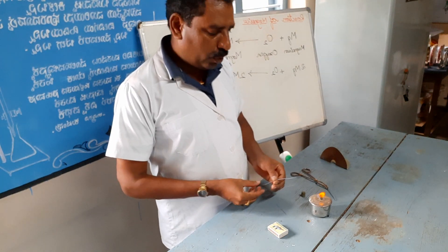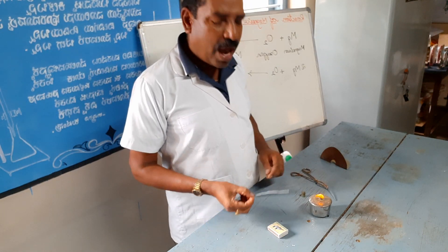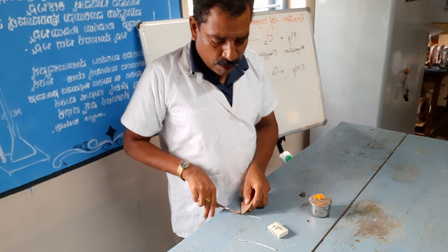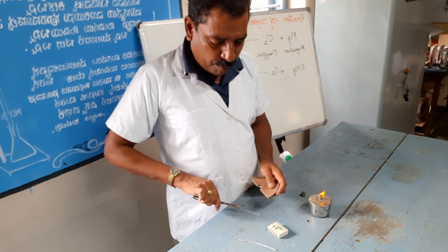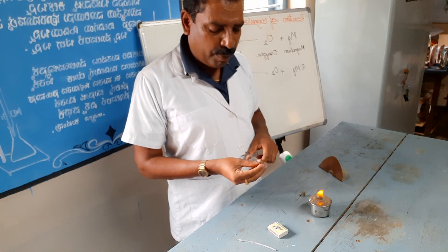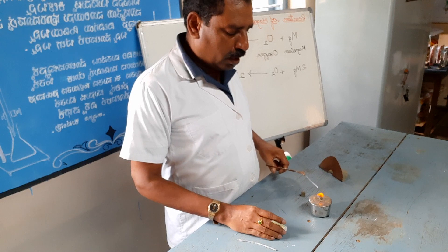Now I am going to show this experiment. Before the reaction of magnesium, we have to clean the magnesium ribbon — that is, remove the oxide layer of the magnesium ribbon — in order to ignite the magnesium quickly. Now I take the magnesium ribbon with forceps or tongs.